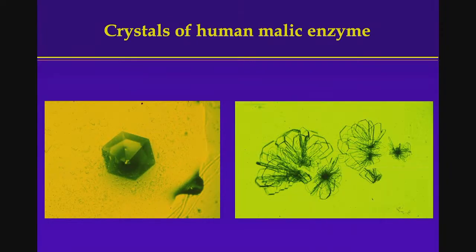And here's another example. Crystals looking beautiful like this, very sharp edges, sharp faces. This is about 1 millimeter across, a gigantic crystal actually. And then these are flower petals, each one quite small. And in the end, it's not how we see beauty, it's how X-rays see beauty. Yeah.